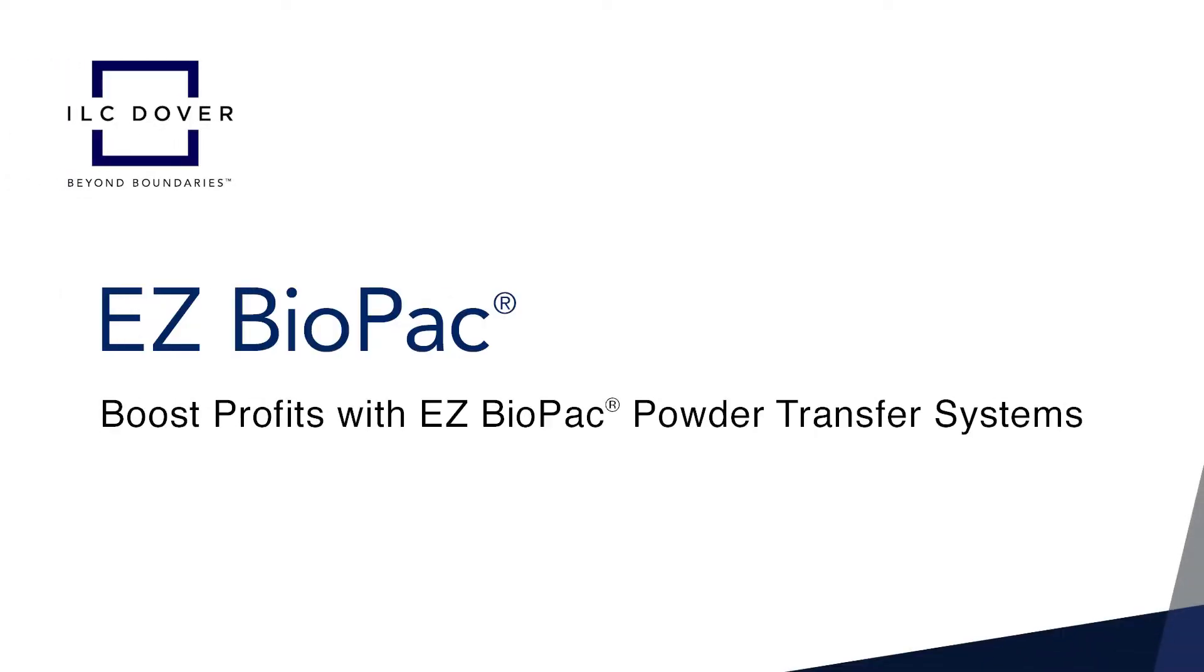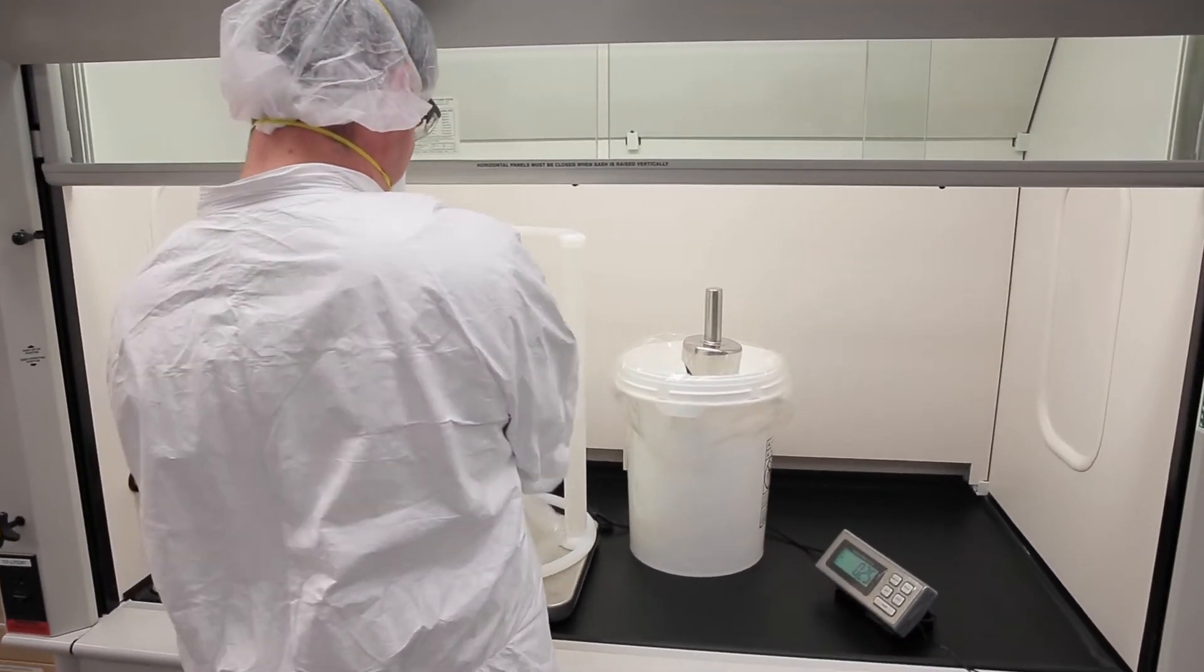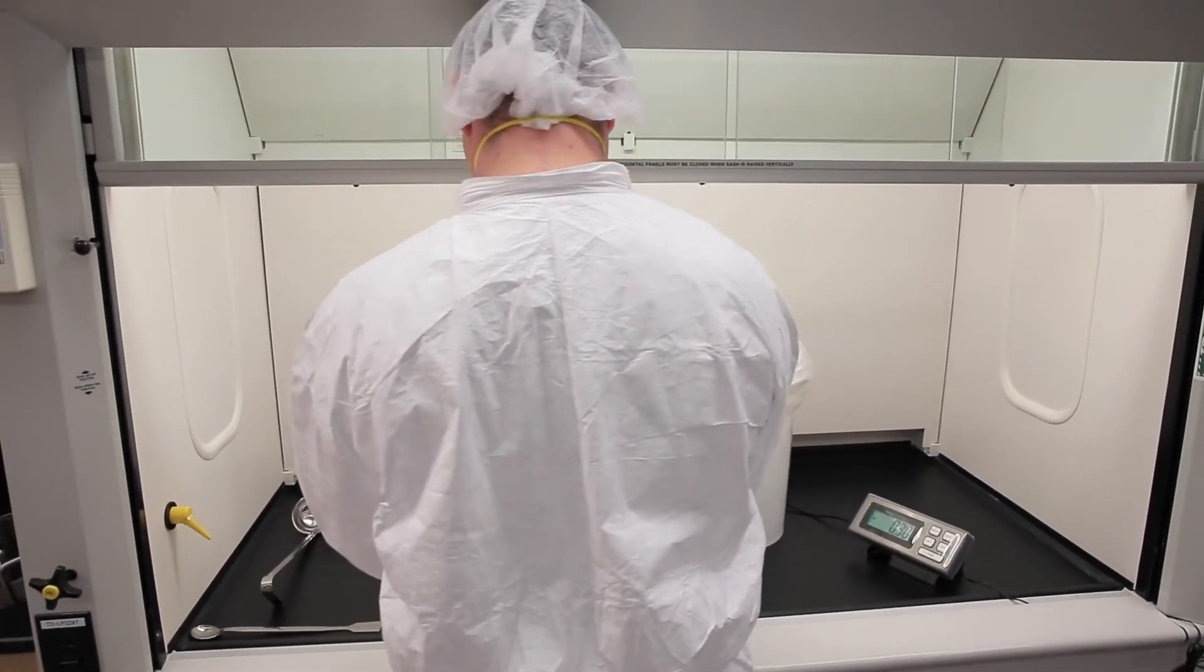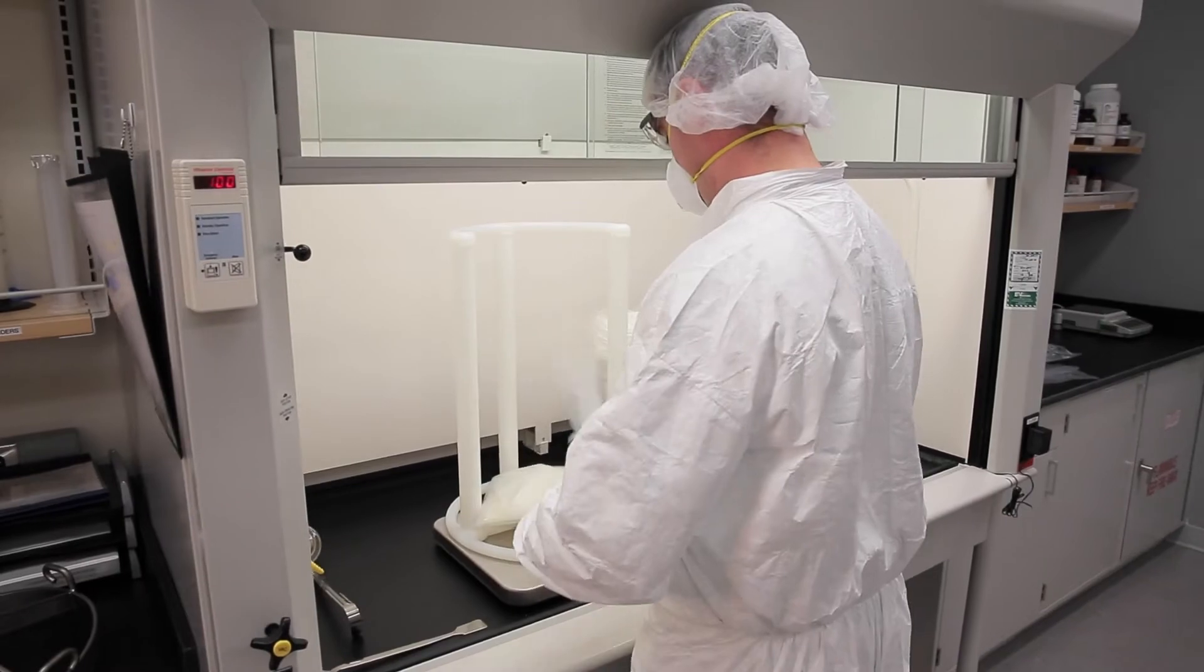As biopharmaceutical manufacturing has evolved, single-use containment for powder transfer has proven its value, but not all single-use systems were born alike. We'd like to tell you how our EZ-Biopac single-use containment and transfer system can help you improve productivity and profitability.